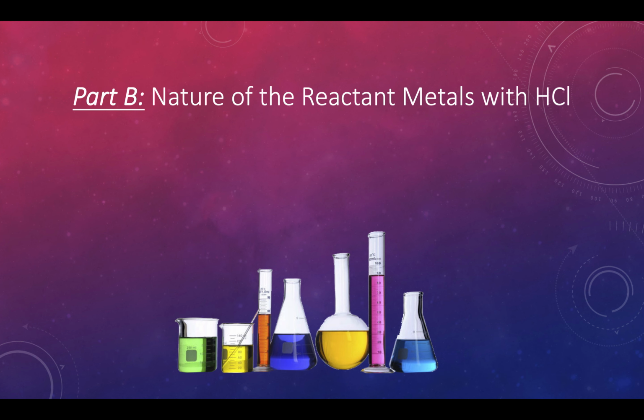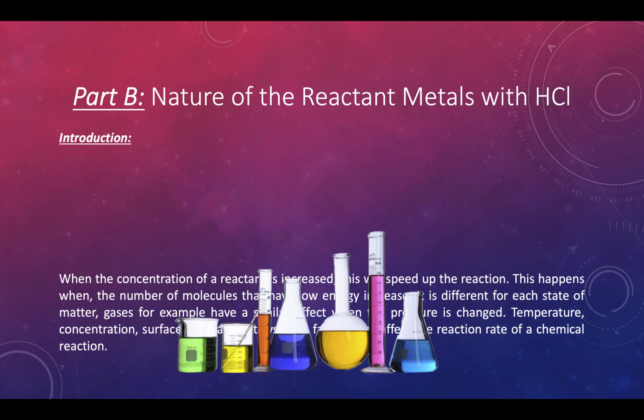I will be talking about Part B, the nature of the reactant metals with hydrochloric acid, but I do want to give a small introduction about the whole experiment, not only Part B.